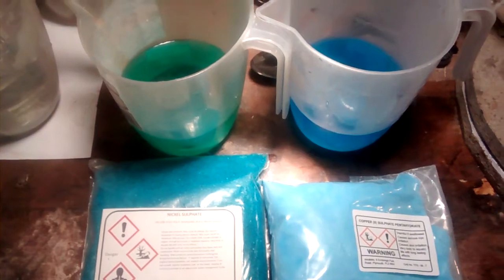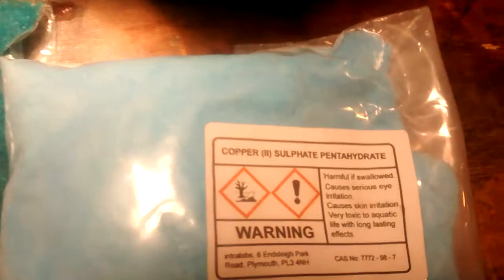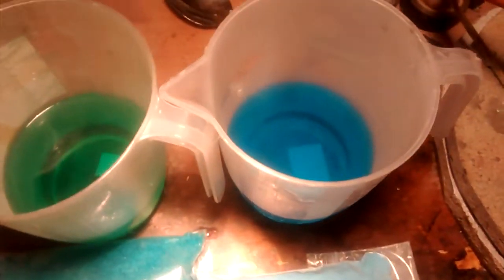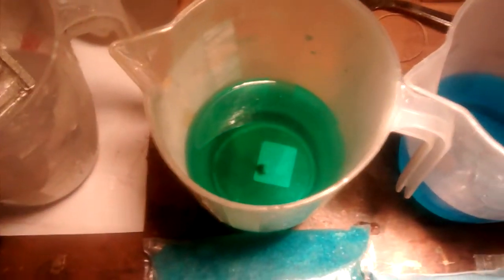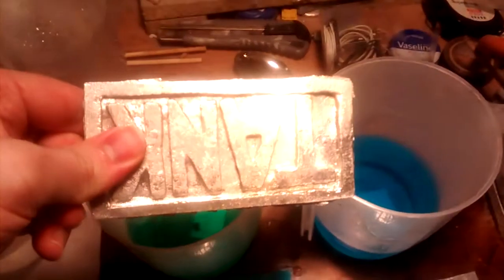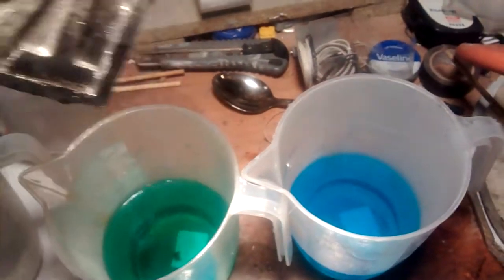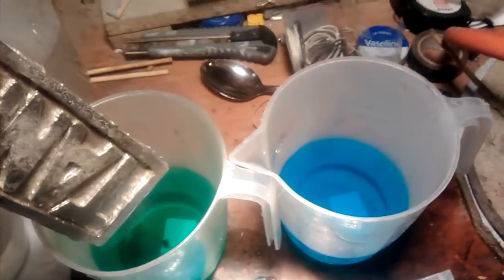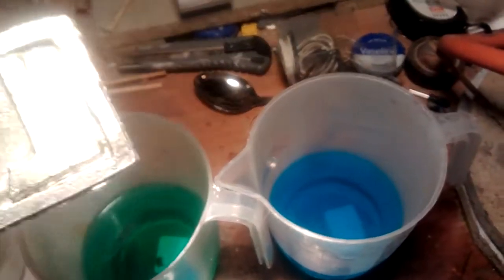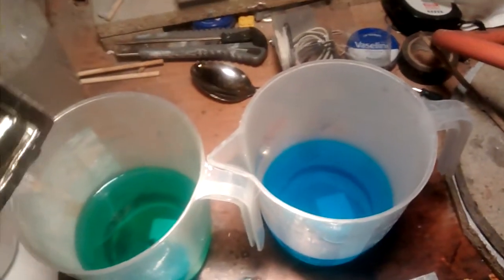I have here two solutions, one of nickel sulfate and one of copper sulfate, and I have equal amounts and both of them have been dissolved in boiling water. I also have here a belt buckle, which has been soaking in a sodium hydroxide solution for the last couple of days. What I'm going to do is put one half in the nickel sulfate solution, the other half in the copper sulfate solution.